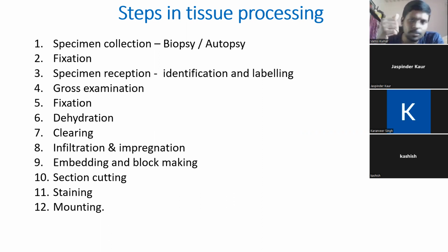Now we will remove water from the tissue, which is called dehydration, by suspending the tissue in graded alcoholic solutions. Now we need to remove the alcohol because alcohol can cause a bleaching effect on the tissue, and it can also form some free radicals that may damage the tissue. So this alcohol will be replaced by a clearing agent such as xylene. We also need to ensure that the xylene has a refractive index equal to that of the glass slide, so the tissue will be clear and we can clearly identify it under the microscope without any blurry images.